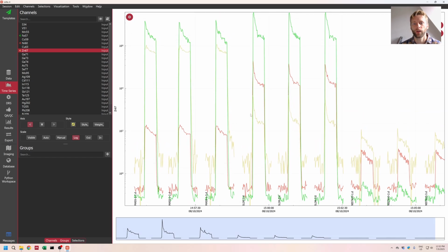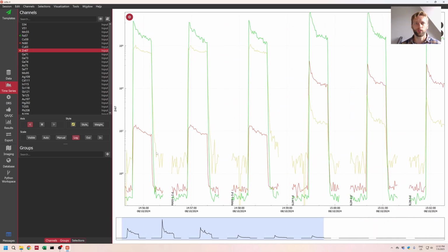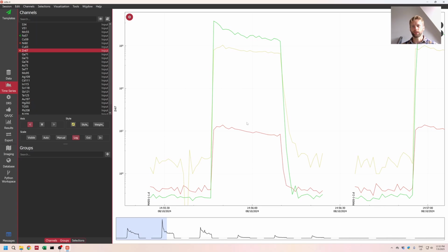There we go. Okay. So the first thing that we need to do is create a background group. Let's zoom in, and let's remember how the laser works. Here's an individual analysis. When an analysis begins, the laser is off. We're just collecting background. Here's this particular analysis, mass 1,1.